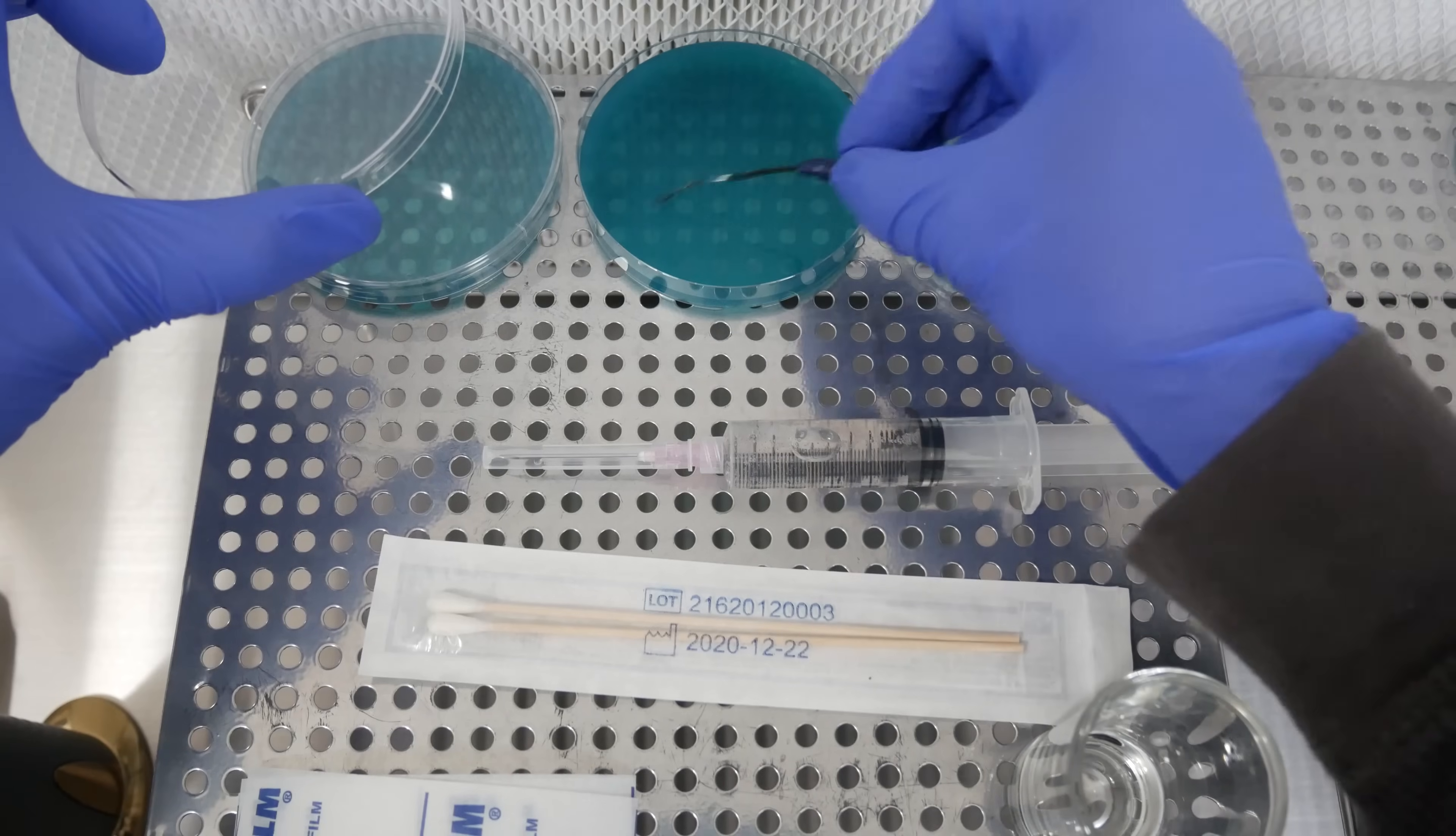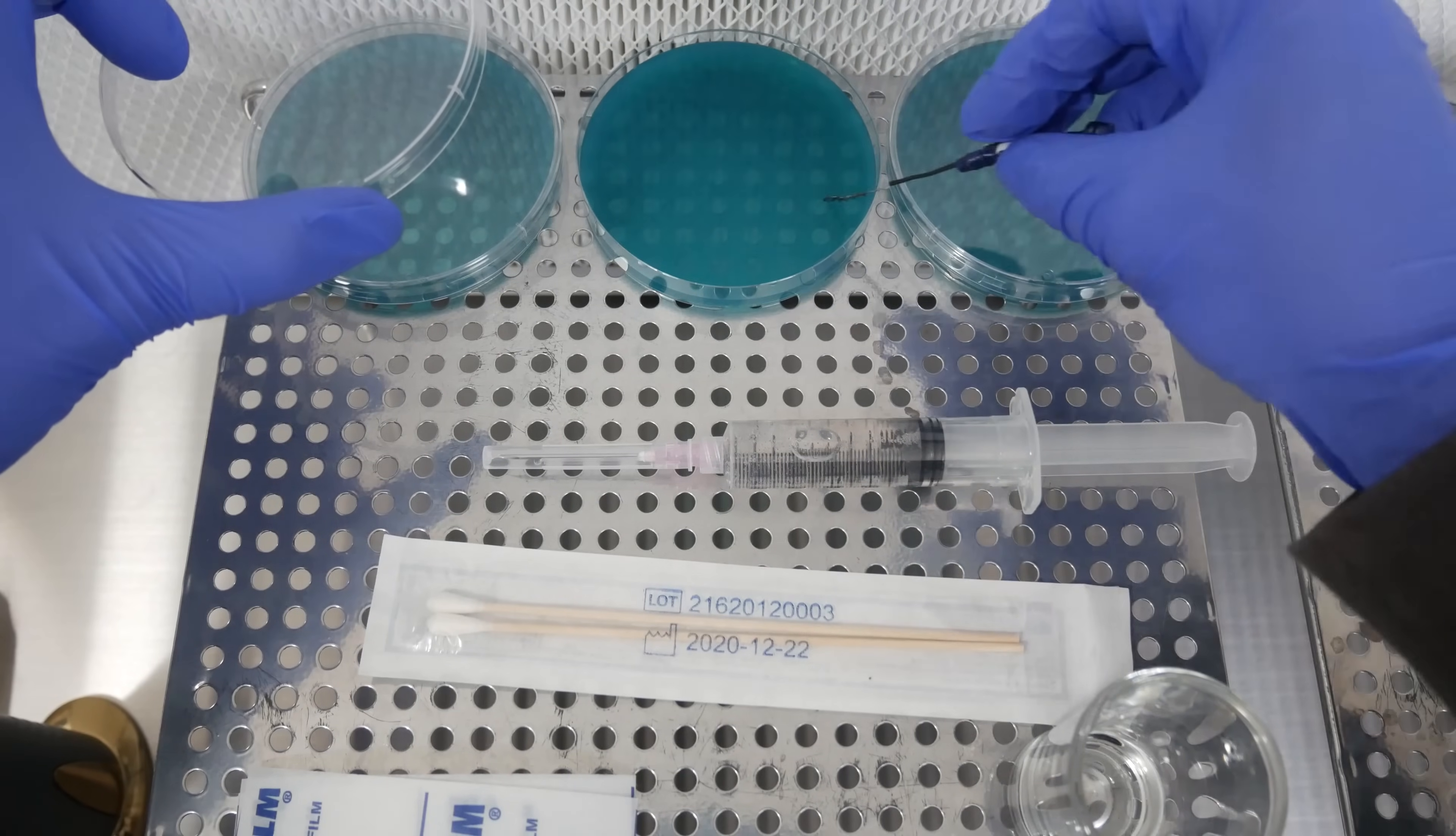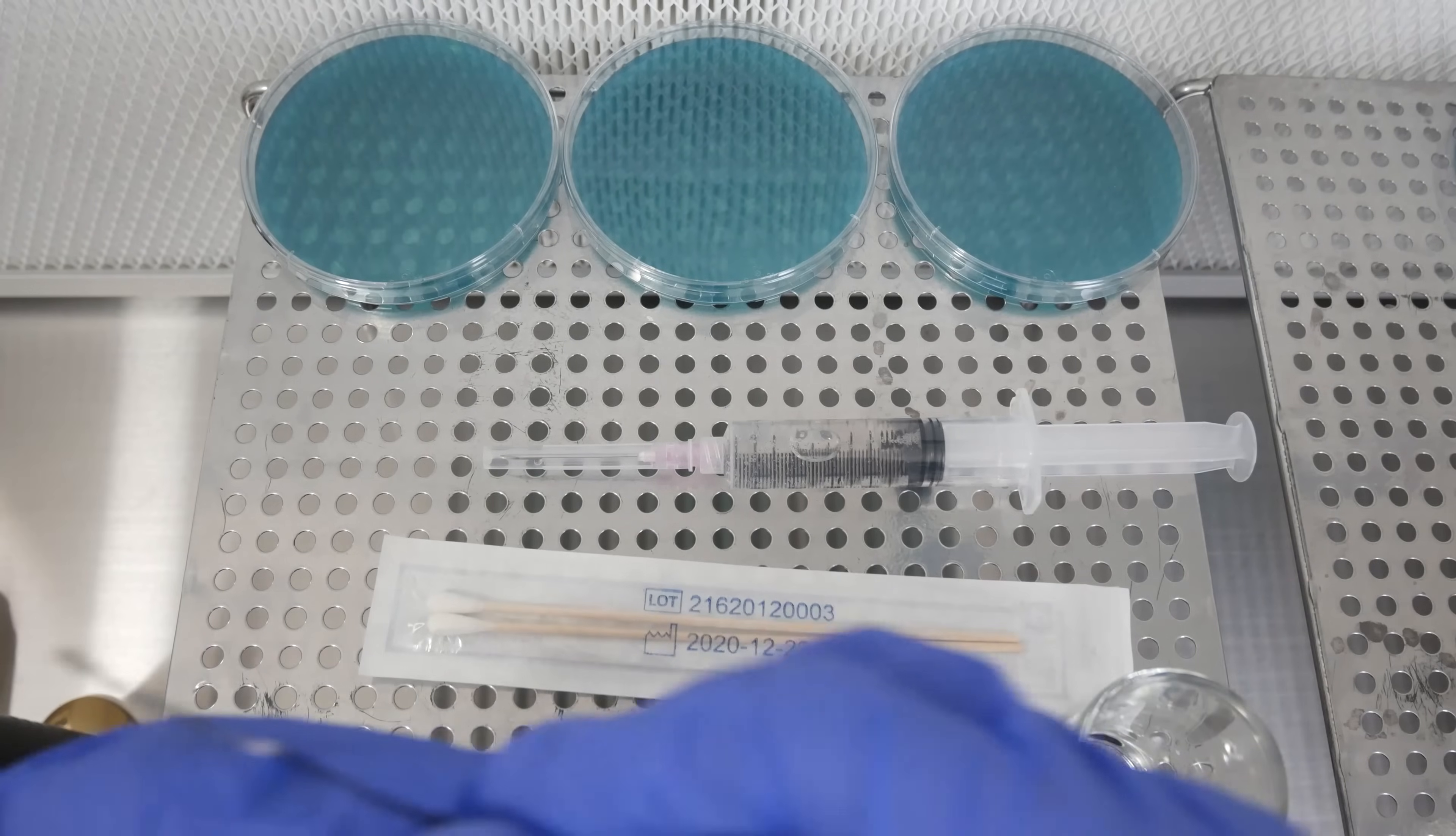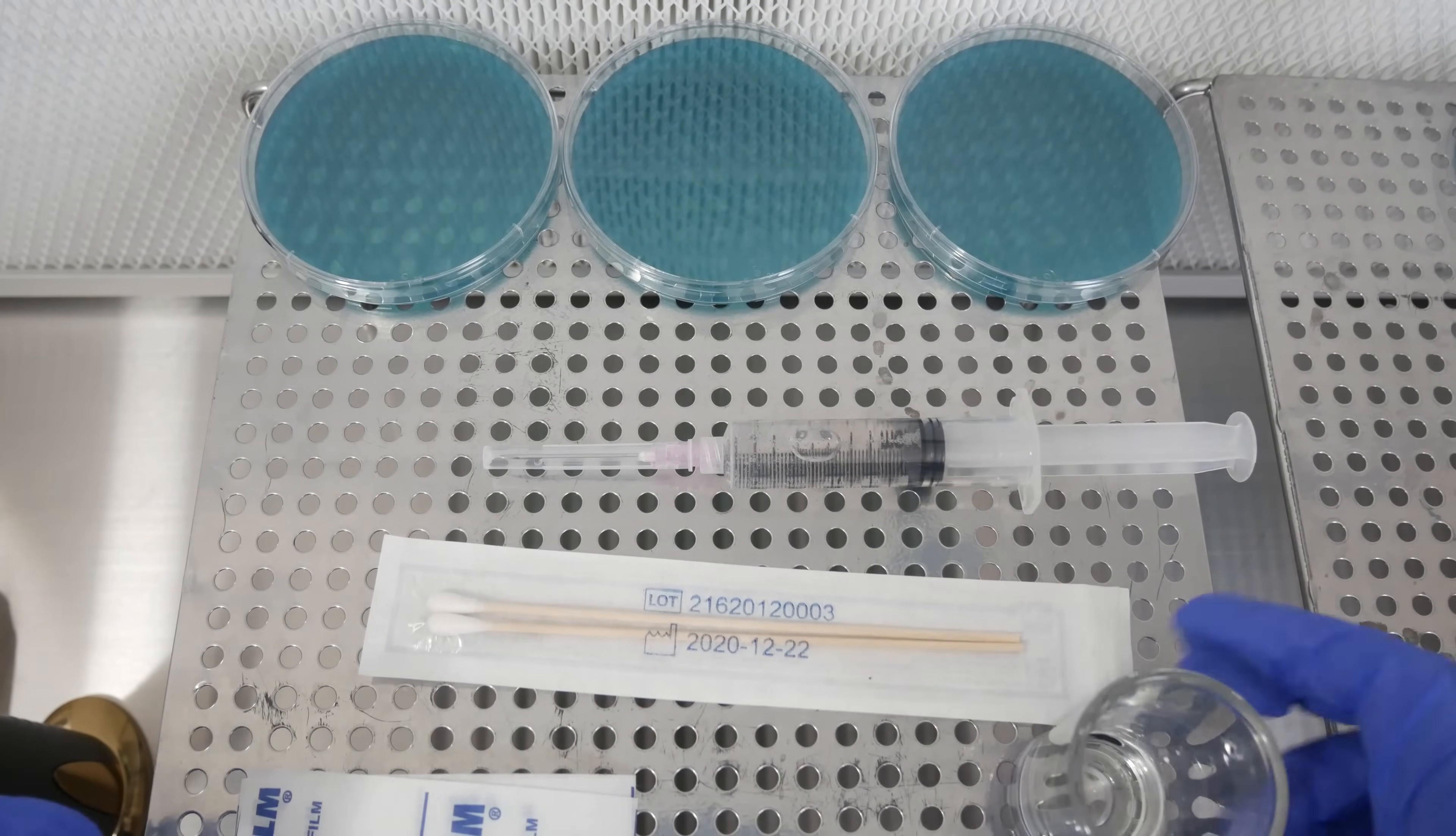I like to kind of do a zigzag motion, kind of like streak it across the plate. The more surface area you can touch on the agar with the loop, the better off you'll be at getting the spores to land on the agar.